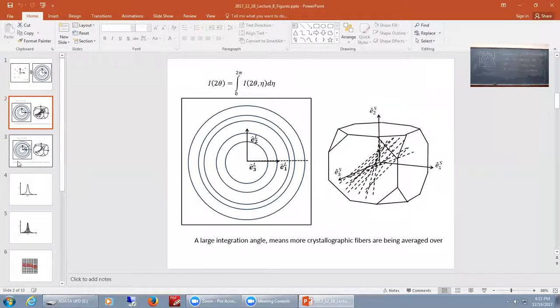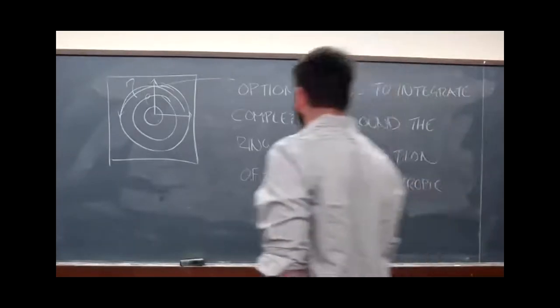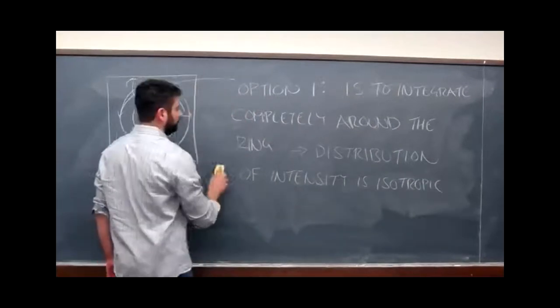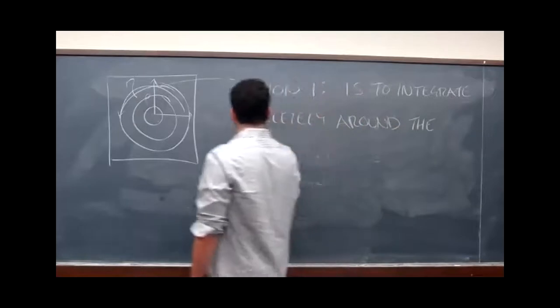Our second option is to integrate over a small subset, or a small angular range.